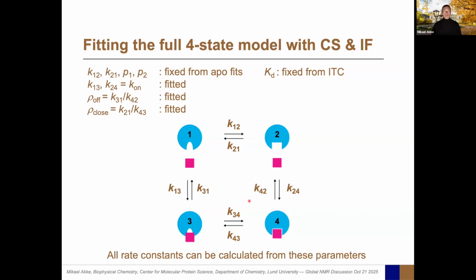Yeah, no. So I think in many cases, in general, you could use that assumption, except in cases where you know that there's a big conformational change. Suppose there's a protein, one of these states would be like this, and the other one would be a big, huge domain opening. Then it's clear that a ligand coming in, I'll use my fist instead, like this, a ligand coming in and transiently forming a transient encounter complex here, and then maybe diffusing until it finds the binding site.